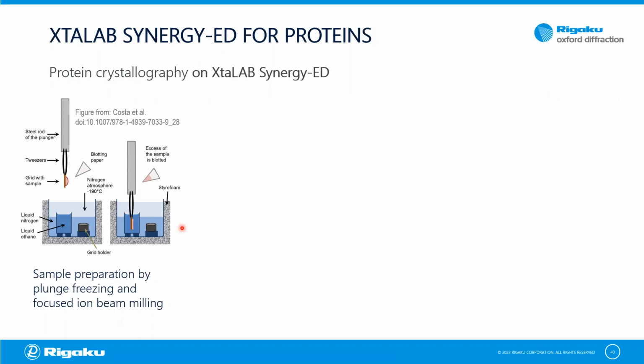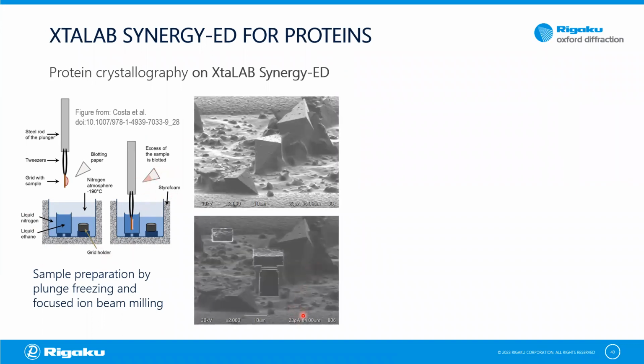So electron crystallography on proteins is something that has also now been around for almost 10 years or so. It needs quite different preparation techniques from small molecules or also from macromolecular crystallography with X-rays. The techniques are usually more borrowed from cryo-electron microscopy, so they involve vitrification and liquid ethane. I'm not going to go into details about this. We have run test experiments where we did this and then prepared nice thin lamella from these microcrystals using focused ion beam milling, cryo-focused ion beam milling.